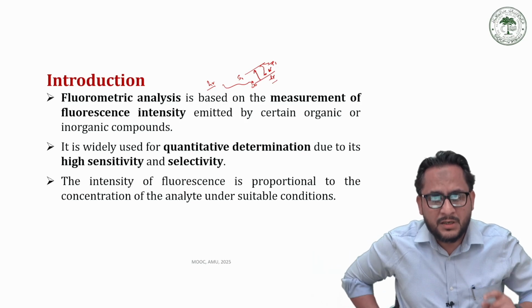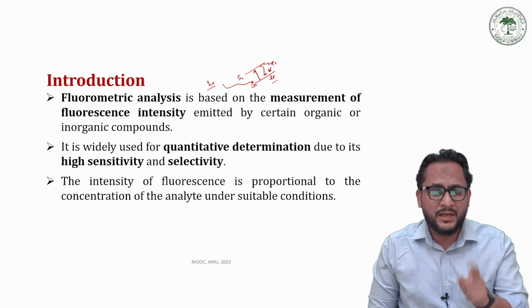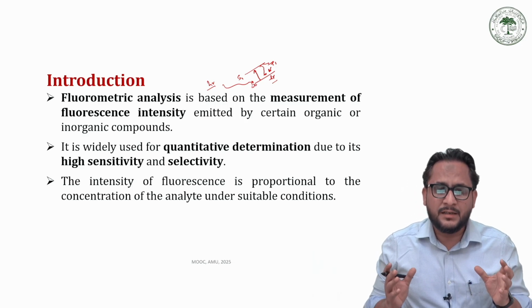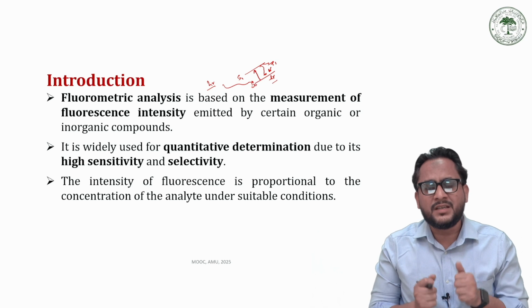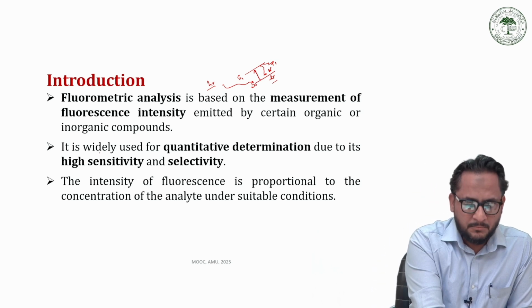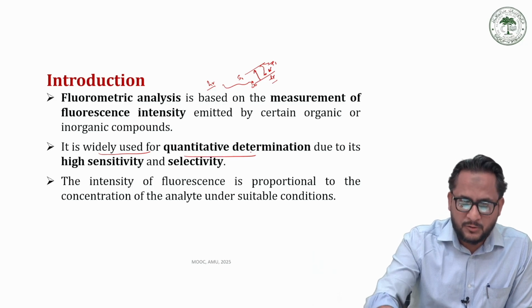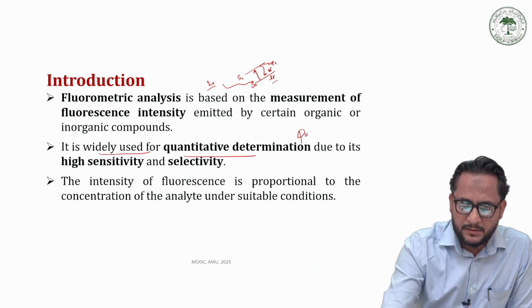Therefore these two indirect methods made this technique widely used in research and innovation. It is widely used for quantitative determination as well as for qualitative analysis.